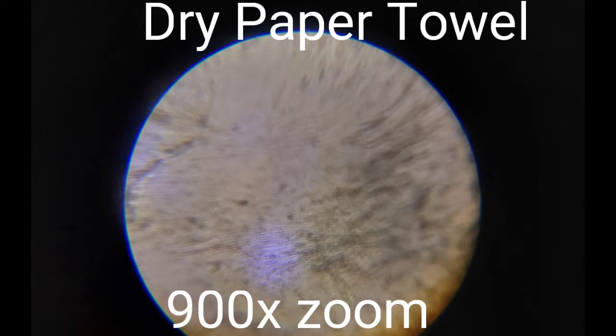All right. So now here we have a dry paper towel. It also has a lot of bacteria, but it actually looks very surprisingly similar to the super glue.